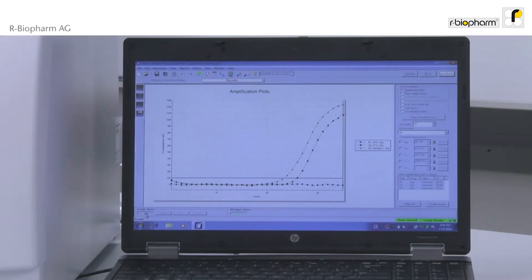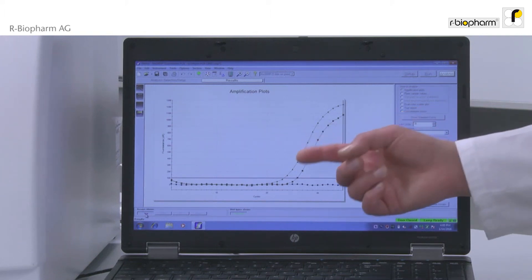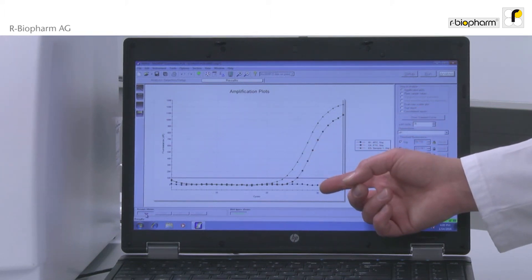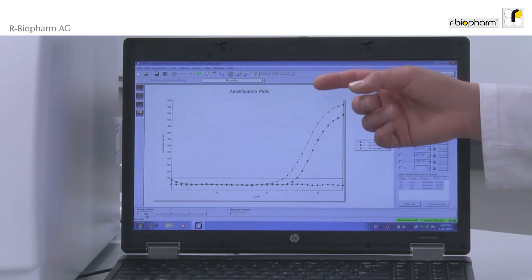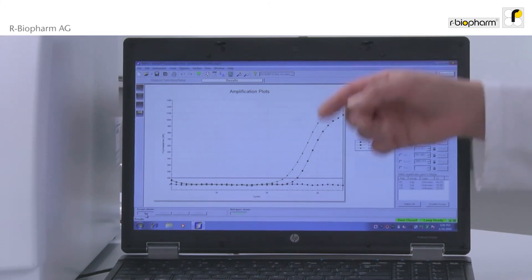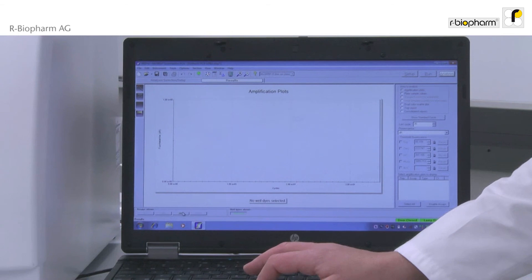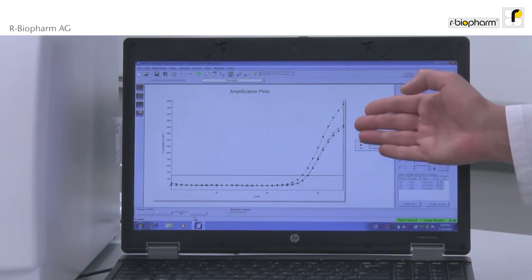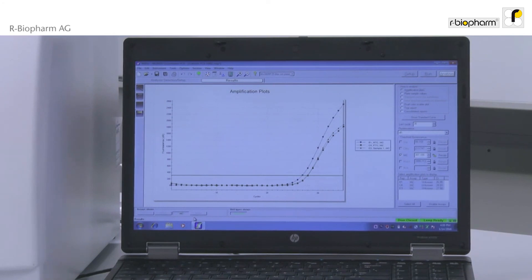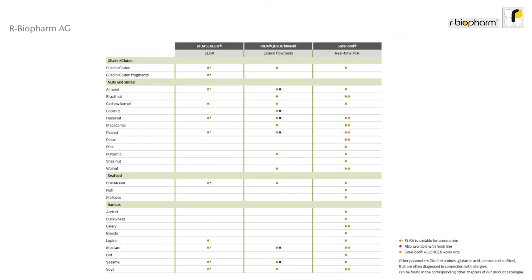If a specific DNA sequence is present, it is amplified and simultaneously detected during polymerase chain reaction. Here the results of the real-time PCR run are shown. Negative control is negative. Positive control is positive. Inhibition control is satisfying. Sample number one is positive.